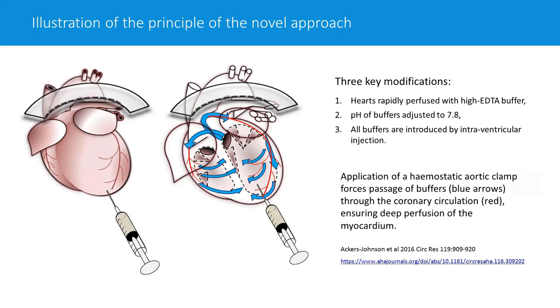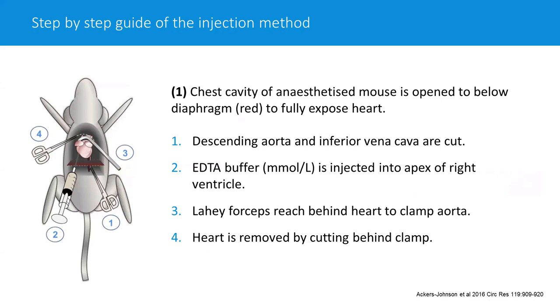And of course, as I've already mentioned, all the buffers are introduced by intraventricular injection, which of course is not particularly expensive, so it allows everyone to use this technique in their labs. So I will just take you now through a step-by-step guide of the injection method.